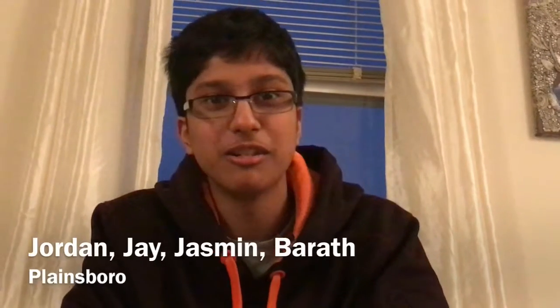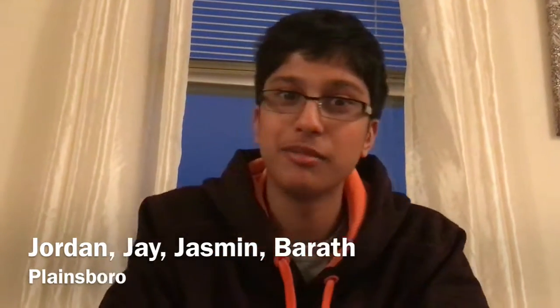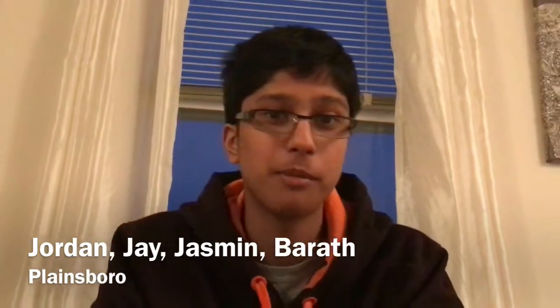So me and my group have been tasked by a key executive to make a how-to video for his new upcoming drama series. We're just gonna go through fingerprinting and various things about it. It's gonna be showing you how to roll prints, dust prints, and how to identify various things. We've been tasked to make sure the show is as realistic as possible, and by the end of this video, we hope that you've also learned a lot.